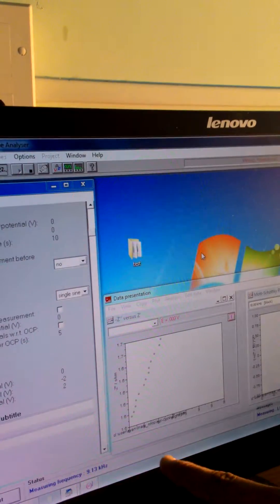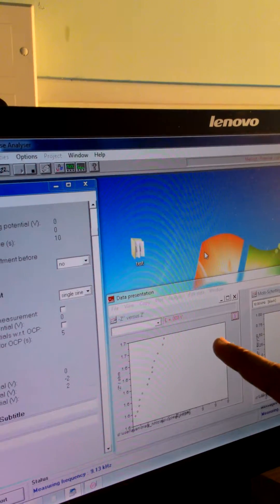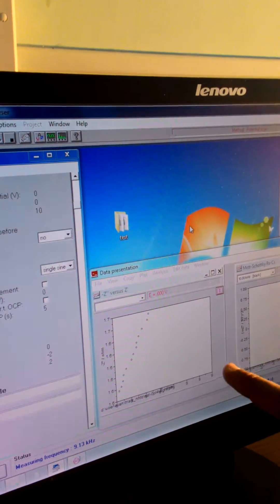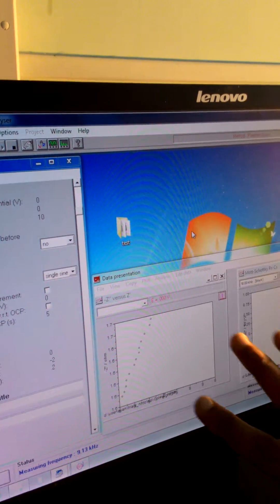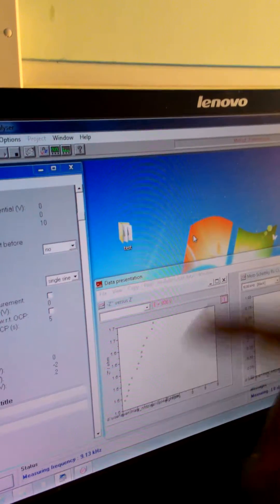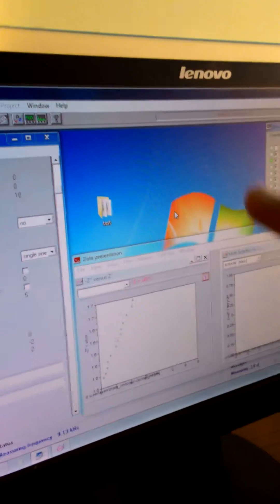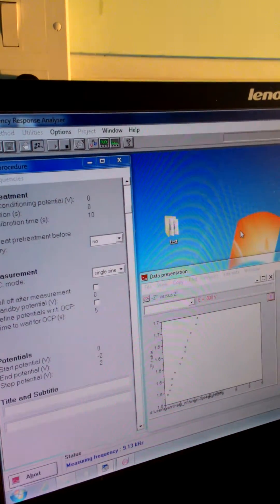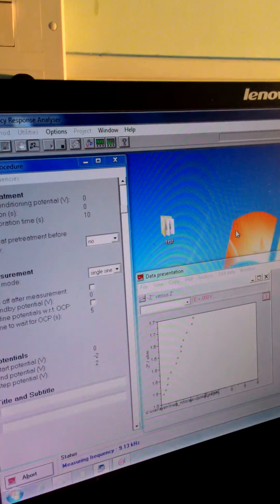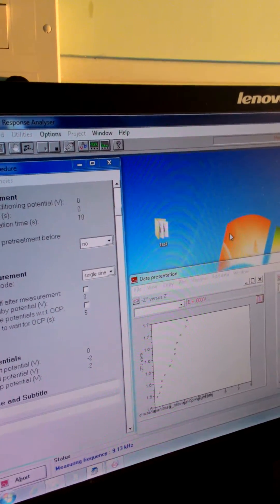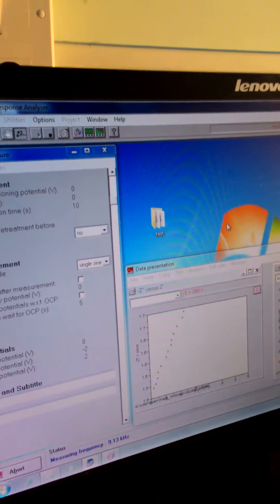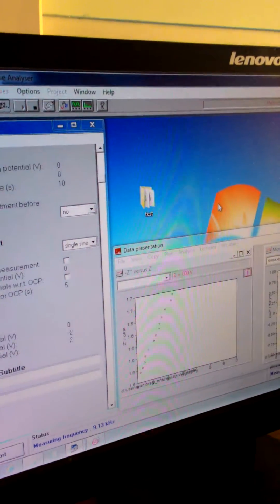Select the file from where you saved the previous file, where you are saving the data. Select that. And then there is option mod sort key option, every option is there, frequency versus this plot, so it will convert to that file automatically.